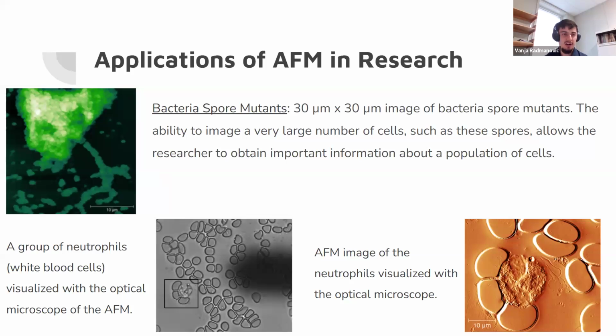So here on the top left, we have an image of bacteria spore mutants. So AFM can also be used to image a large number of cells, bigger images such as these spores. This allows the researcher to obtain important information about a whole group of cells. And you can also learn things about the interaction of cells, such as clustering as cells form groups and adhesion as cells stick together.